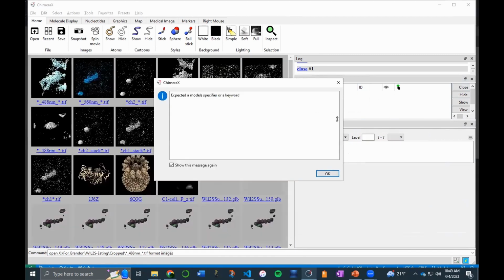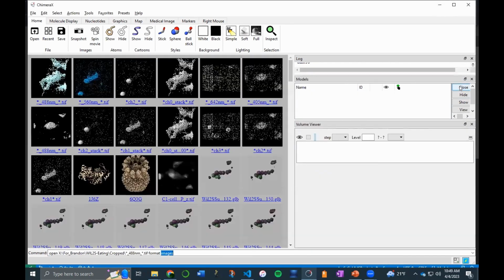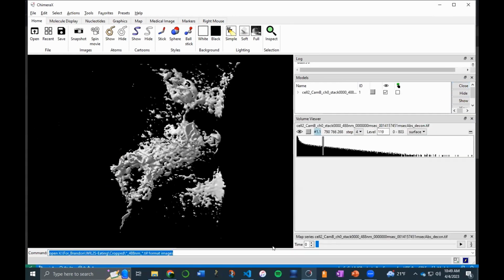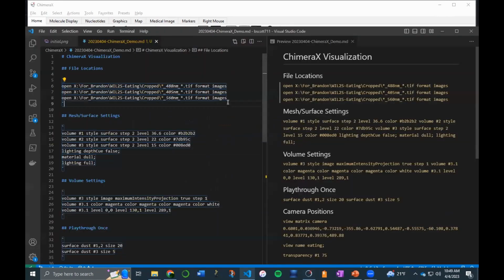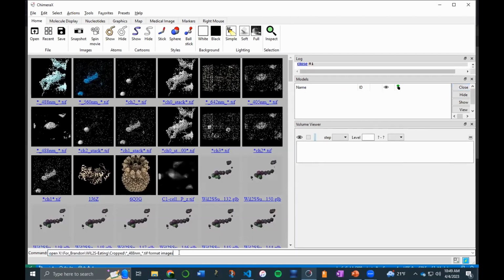All right. Okay, so let's close here, and now we'll go ahead and load in these data. I'll do it a slightly different way for these others. If we were to just copy and paste in the file that we're trying to look at, the nice thing is we can have these wildcards in terms of which of the stacks we want to load in.